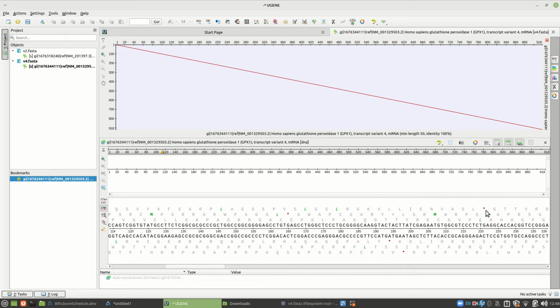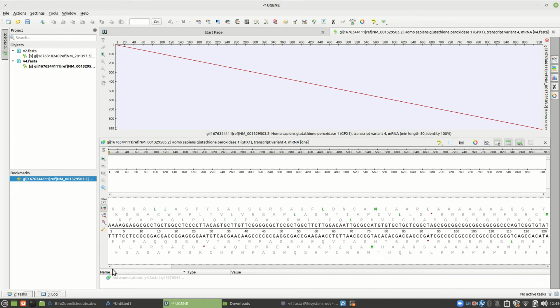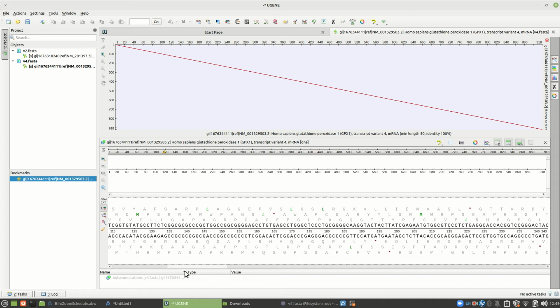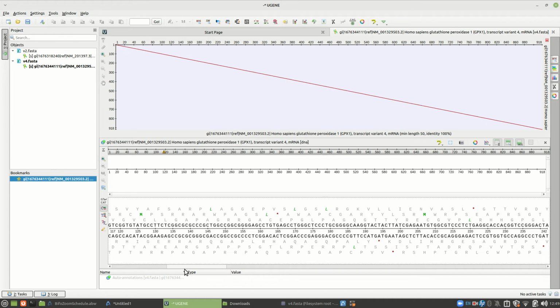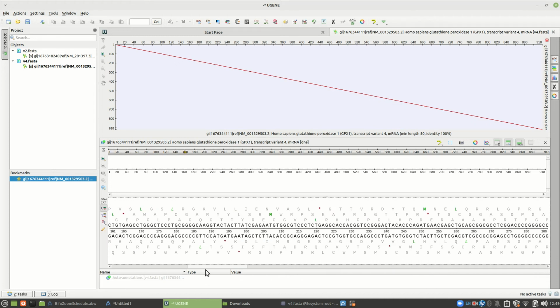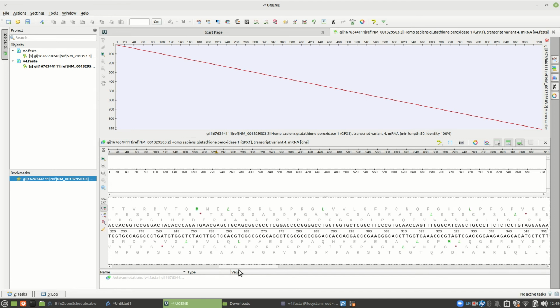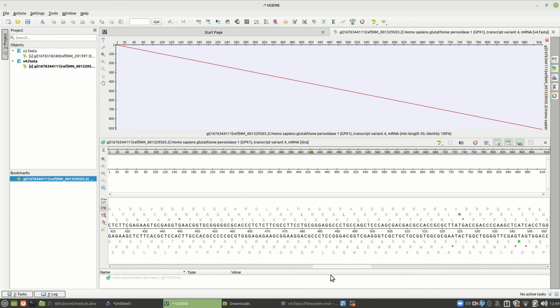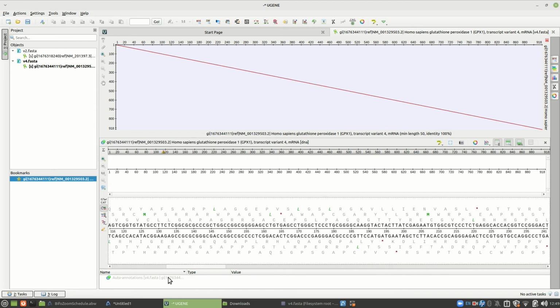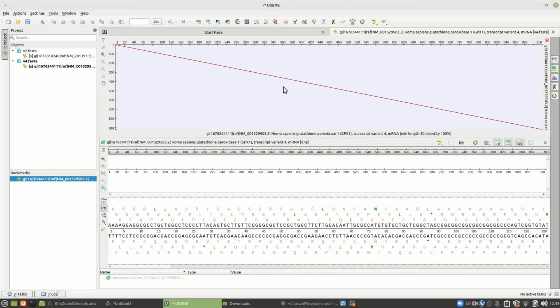Well, that would be the end if that's the case. Here's our protein. It would just be this little short one in between here. And it could be. If you make that justification, I'm good, because that is legitimate as far as we know. I don't see any other stop codons until way down here at 585. But why would we have that second piece going on here?